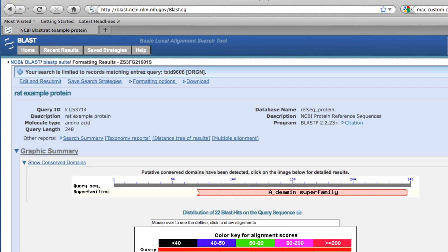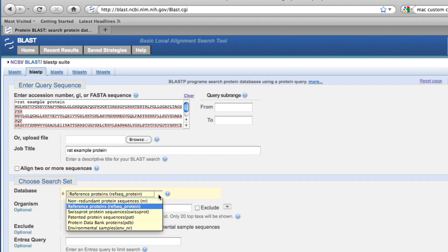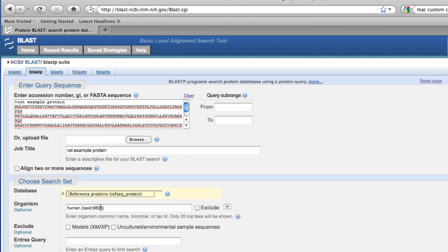The last thing I want to show is the edit and resubmit button. If you wanted to start over, the back button isn't necessarily conducive to saving your previous search. Edit and resubmit will take you back to the BLAST main page exactly where you started, and you can make any adjustments you would like to — for instance, changing the database, changing the sequence, or maybe changing your output organism.